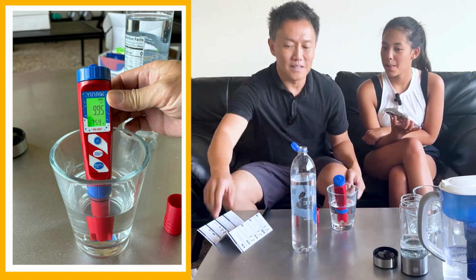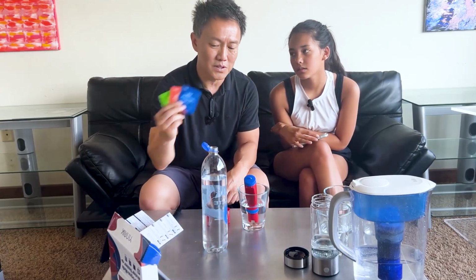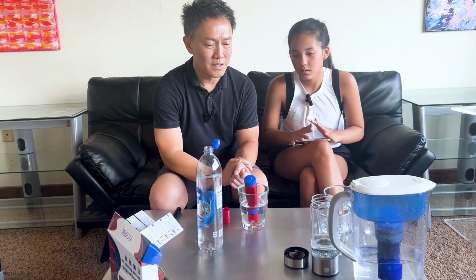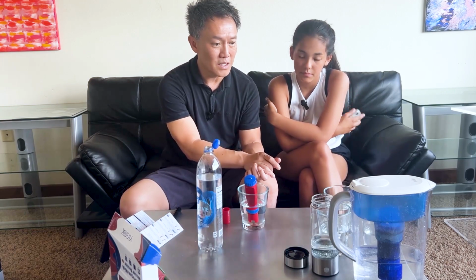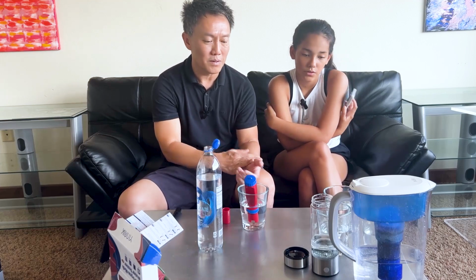One, I think I need to clean this some more. I should have done this a little bit better when we first started. It seems this bottle was accurate. Very impressed. The tap water was really high in pH, although it does probably have fluoride and other chemicals in it, which maybe affects the reading.